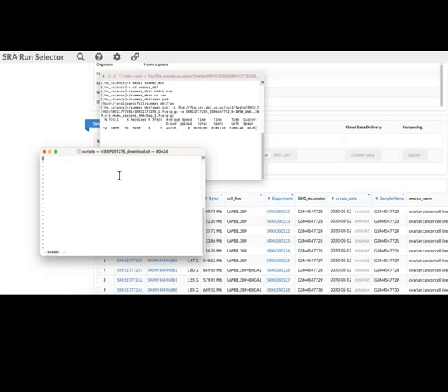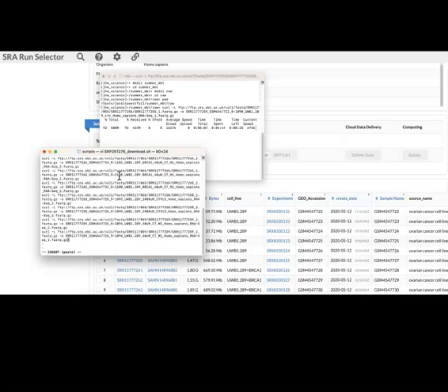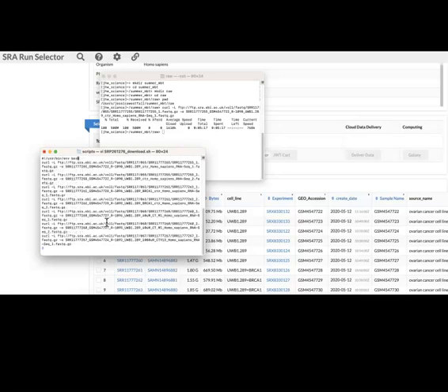And we're going to go ahead and just copy that script in here. I'm going to just Control V. And let's go up to the top. So you can see each one of these command lines is a curl command to download the raw data file.